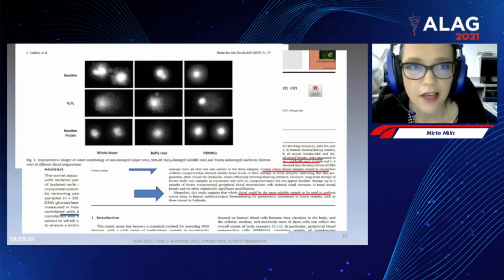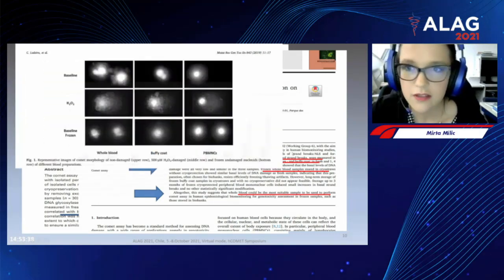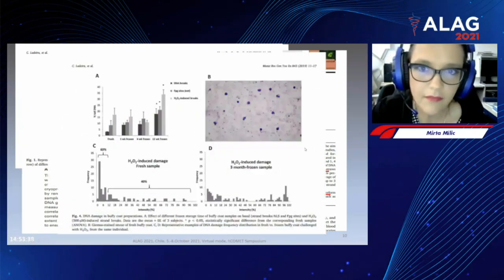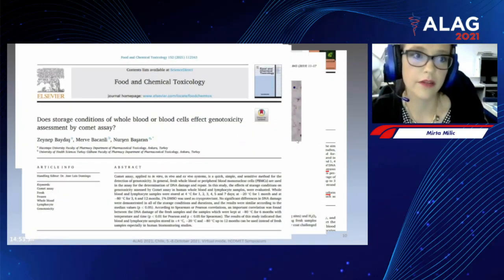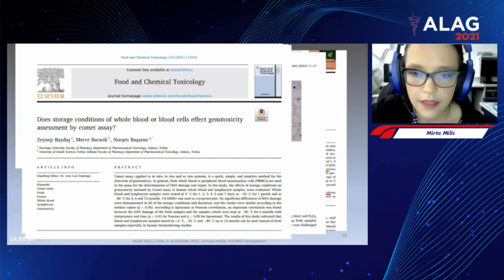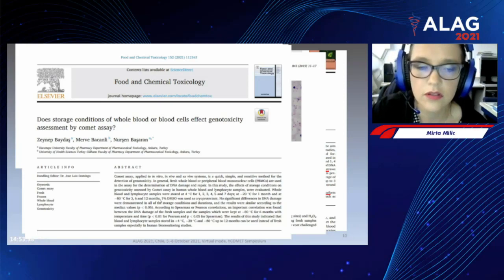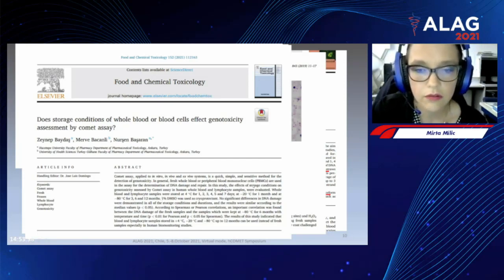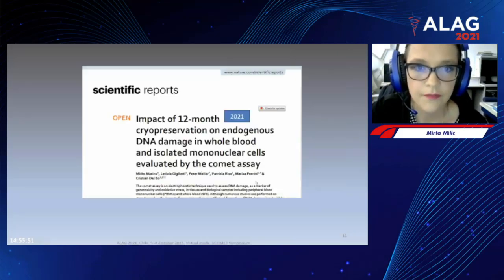I don't have enough time, so I will just show you some pictures so that you see it was really intensive work, and you can check the articles by yourself. At the end, another group has also used cryoprotection for 12 months, and they concluded that it can be used.